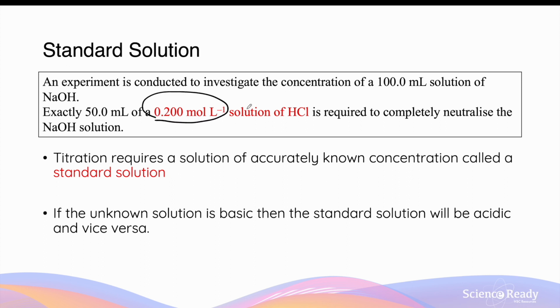This solution of known concentration is called the standard solution, and every single titration requires the preparation of a standard solution. If we don't know the concentration of the solution, then we will never be able to find out the concentration of the sodium hydroxide.